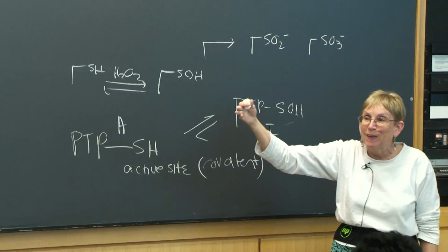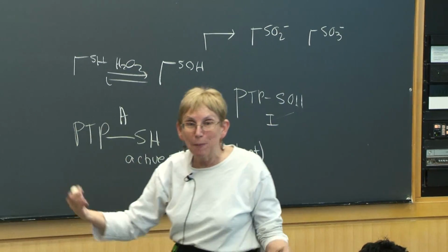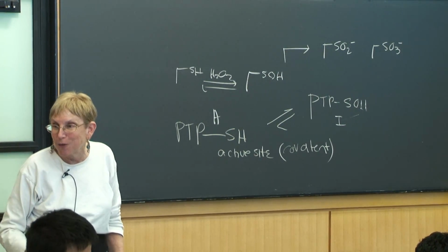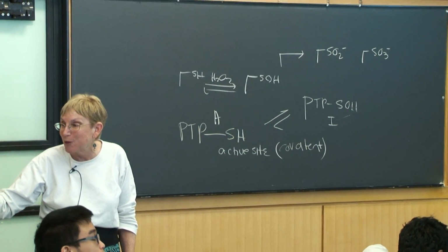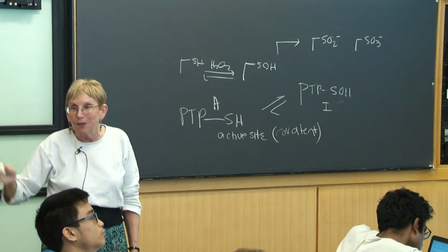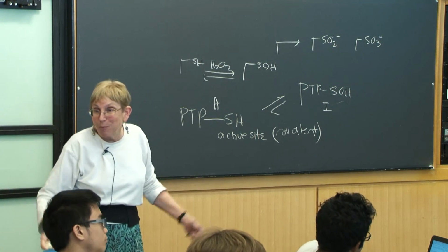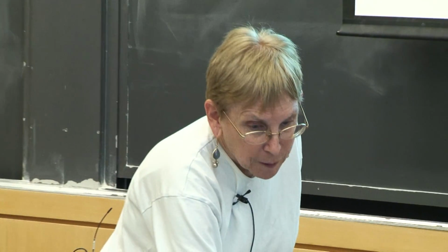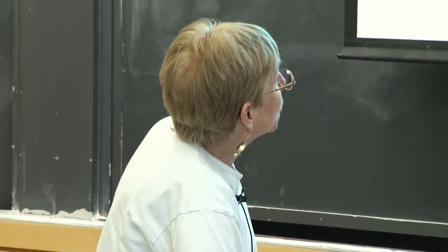And so if you look at that, you're going to have a different mass on your little peptide species. If you look at the supplementary data, they show mass in both of these states. So that suggests that that might provide an explanation for what's going on. Maybe you can think of a lot of other explanations.